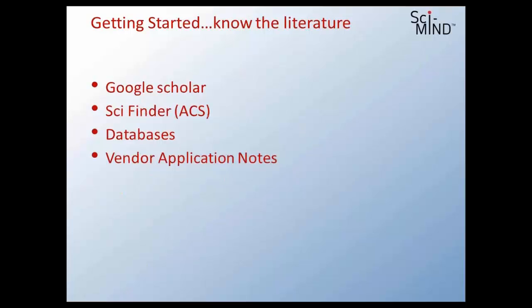This helps us make decisions, and one other thing that helps us make decisions is I go to the literature. And of course, this is one way to find out all of that other information. Some of the things that we didn't have back in the day is, today you have Google Scholar even, and one of the things that I've very commonly done is typed in the name of my favorite compound into Google and see what comes up, or Bing, or whatever your favorite search engine is, and see what shows up there. You may be pleasantly surprised at what you find. You probably get linked straight to the manufacturer and all that information. You might even get the MSDS out of it or something like that.